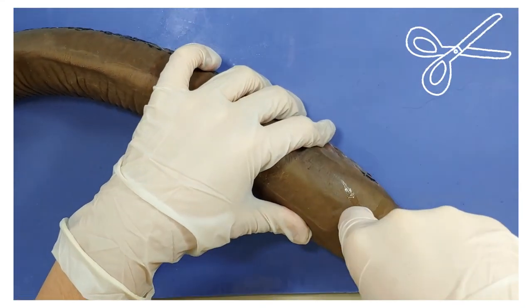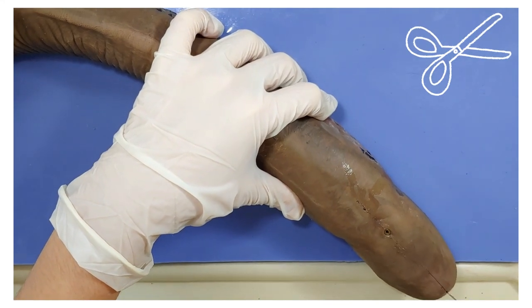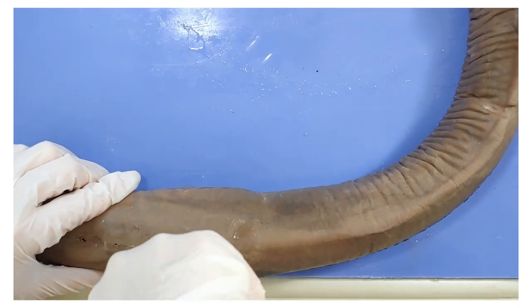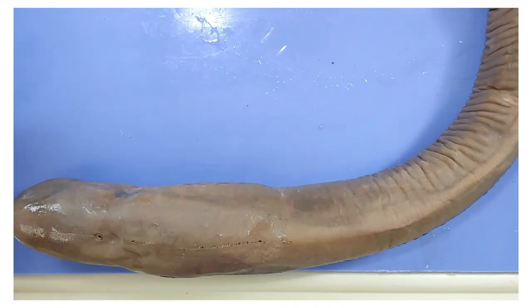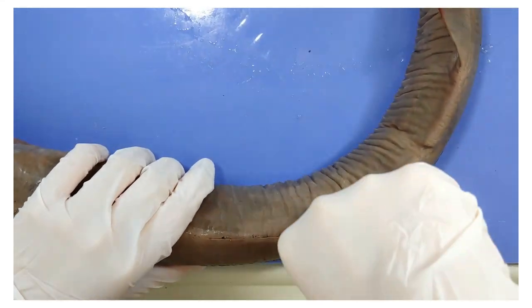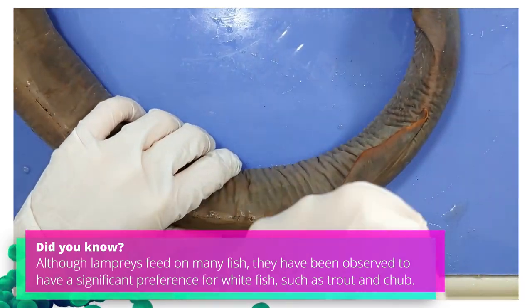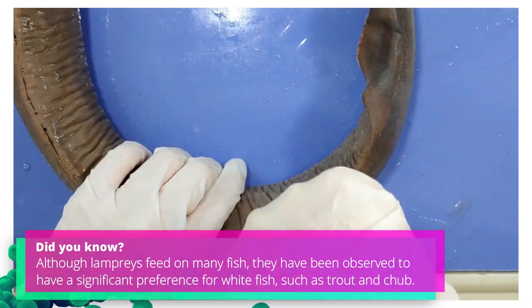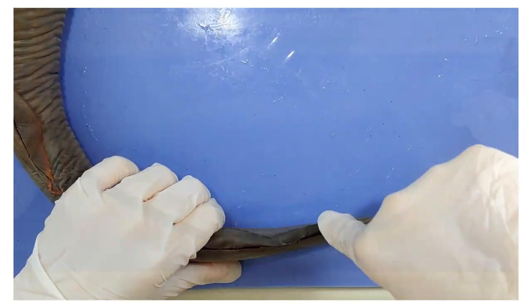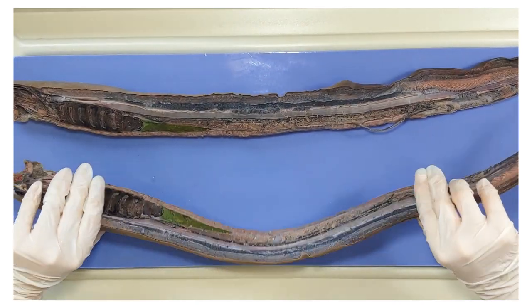I'm going to put a scalpel straight through its back until it touches the mat, and move it forward until I reach the end of the head. Then I'm going to turn it around and continue in the other direction until I reach the end of the tail. Try to keep your scalpel as close to the middle as you can. Now we have two halves of a lamprey.